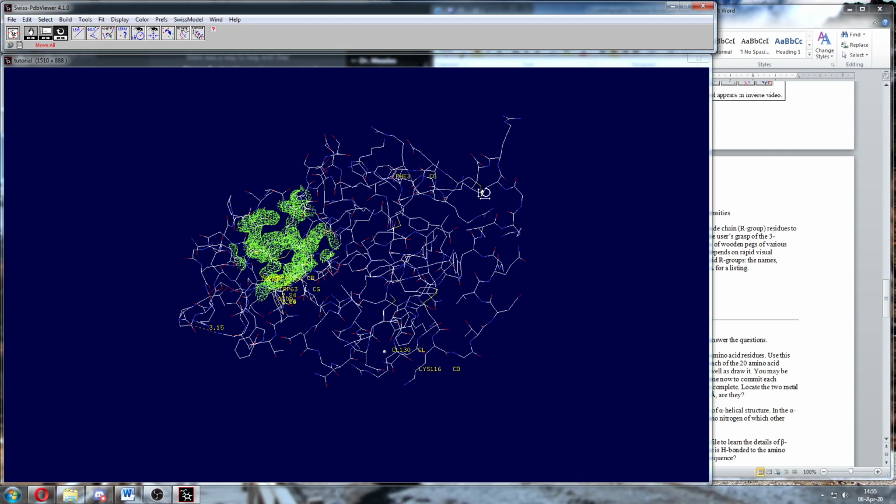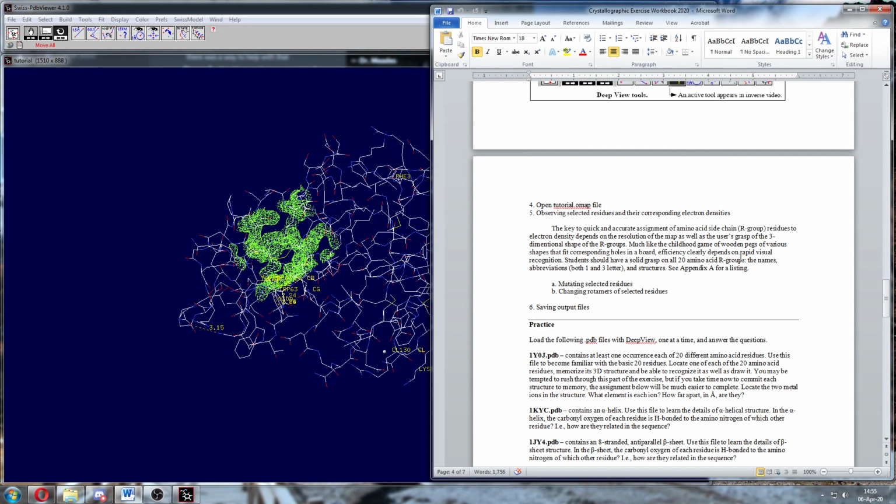Well, there's one right there. Right? And then go label it and see if you got it right. So do 10 one way and 10 the other way. And you can pause the video to finish those. While you're doing those, I have two other questions in this tutorial for you.